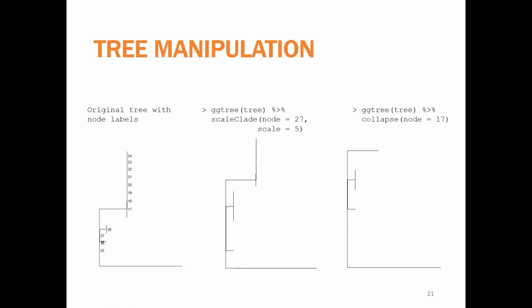Did everyone have a chance to play around with those? Yeah, and there are different tree manipulation options. They're really fun and interesting to play around with just to see what they do.